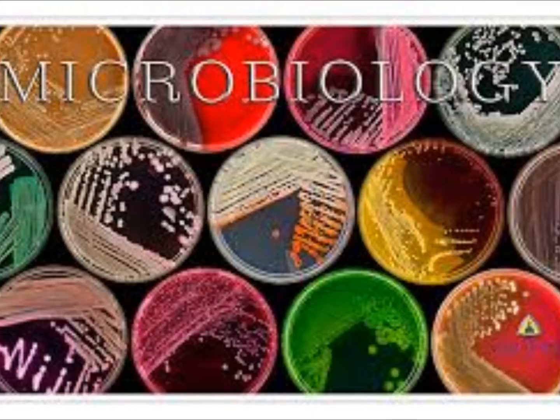For the McConkey, are you gonna record if these three grew yet? If it did grow, is it a lactose fermenter? Did it turn pink? If it did turn pink, you record that as LF, and if it's clear, it's NLF. I did not tell you the acronyms for the McConkey plate. If it's a lactose fermenter, which is if it turned pink, you will record it as LF. If it did not change color, if it's clear or really pale, then it's NLF for non-lactose fermenter.